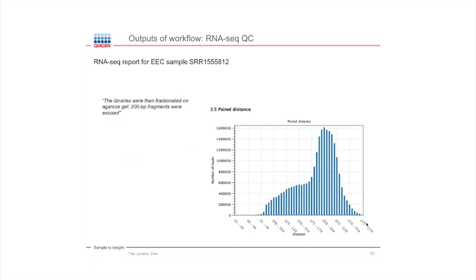And it turns out that this is what I guess is happening, that if you cut out the gel by hand on which you've got these fragments from, then you can sometimes get these imprecisions. And it looks like that's what's happened here. But it's the same in all of the samples, so I'm not very worried about it. I've also tried removing certain transcripts to see if this peak fades away, and it's not, so I imagine that it's just a distribution that's the same for every transcript.